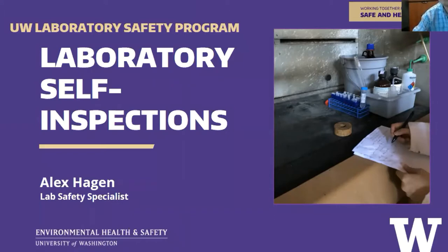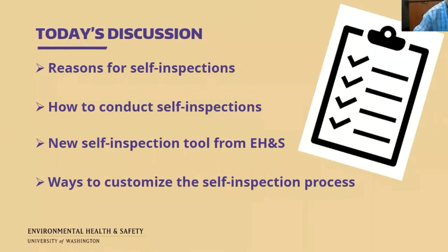Okay, we'll go ahead and get started with today's webinar about laboratory self-inspections. We're going to start off by discussing the reasons for doing self-inspections. Then I'll talk about how to conduct self-inspections and the key elements for them. I'll be showing you how to use EH&S's new self-inspection tool. And then we'll talk about ways that you can customize the self-inspection process to make it as effective as possible.